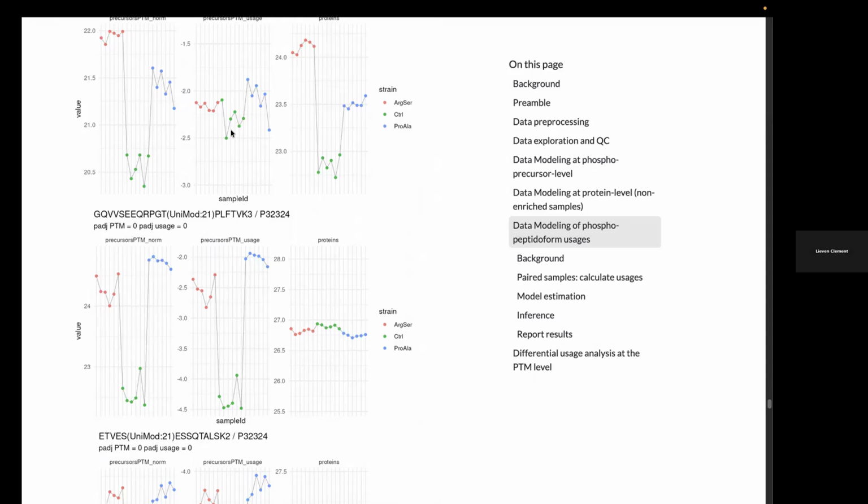And then, if you still continue, you don't know, is it because of normalization that went wrong or whatever? You could try to normalize, but maybe you would overcorrect. So if I see pathological cases, I always like to go back to the technicians. But yes, we see many.